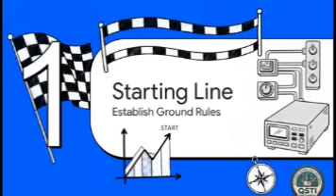First up, the calibration starting line, where we establish our ground rules. So, your very first rule, straight from the manual, is this. For a first-time startup, you absolutely must use the exact same reporting range setup as the factory calibration. Why? Well, it allows you to accurately compare your fresh, new calibration results directly to the factory settings listed on your final test and validation data sheet. It's basically an essential reality check for your instrument.